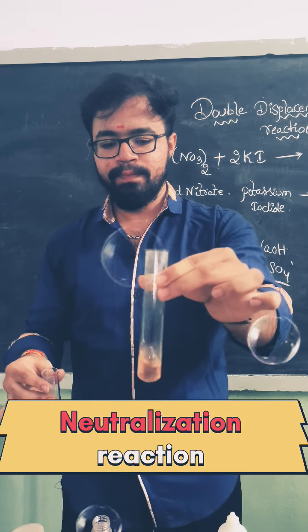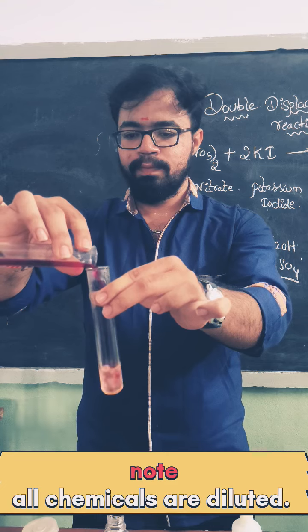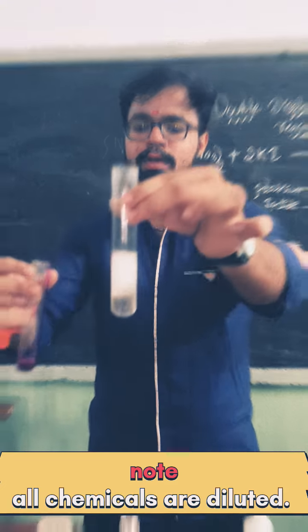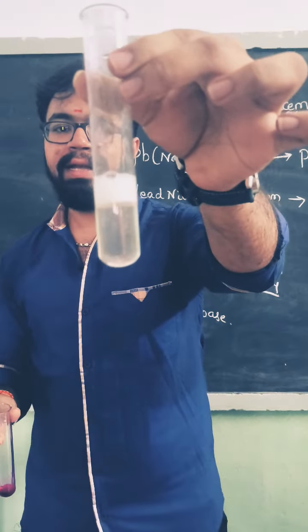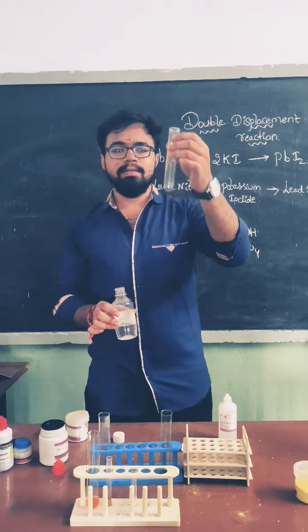You're watching neutralization reaction. When acid is interacting with the base, it results in the formation of salt and water. And now let's deep dive into this experiment of neutralization reaction.